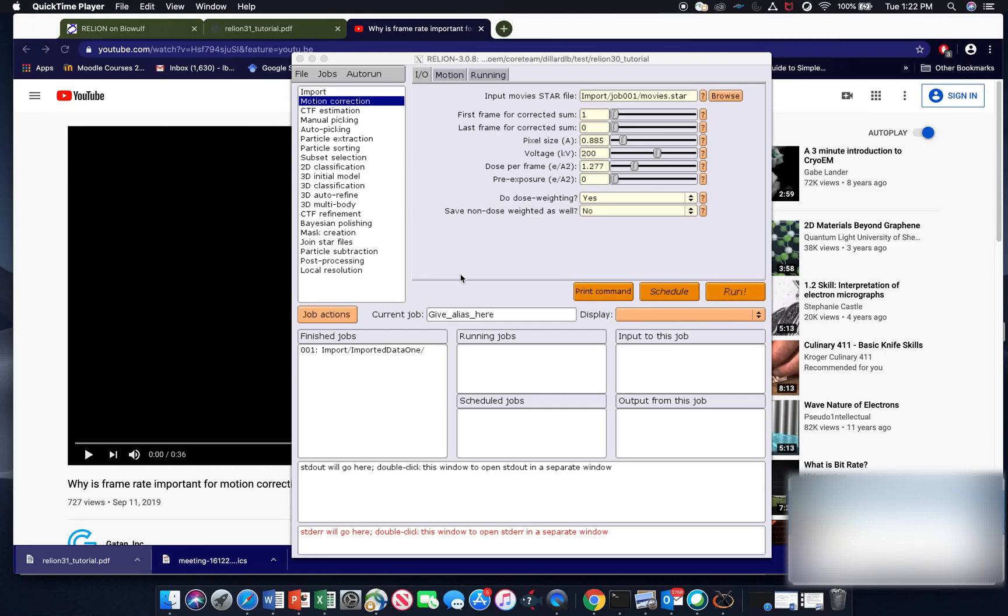Okay, so now we have imported our data and we are ready to do motion correction.